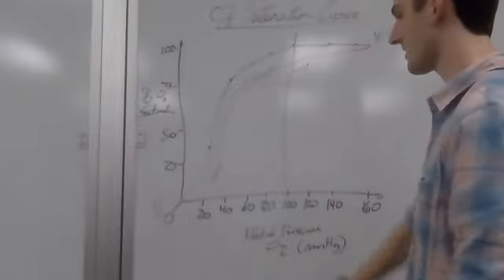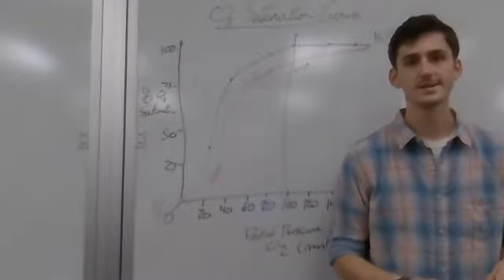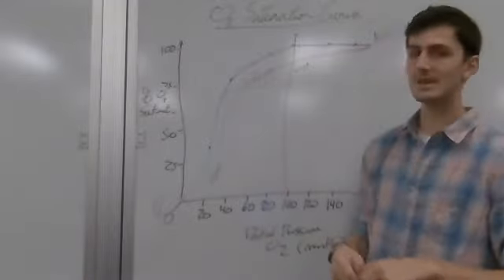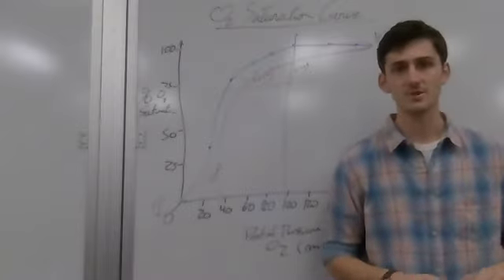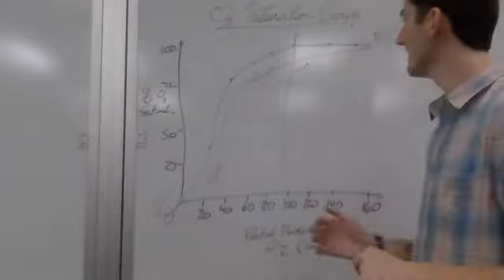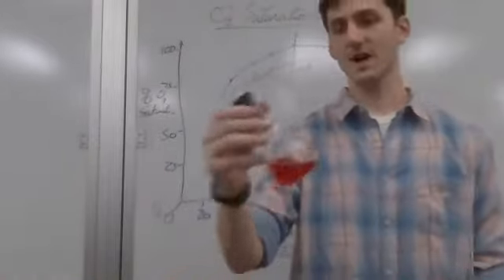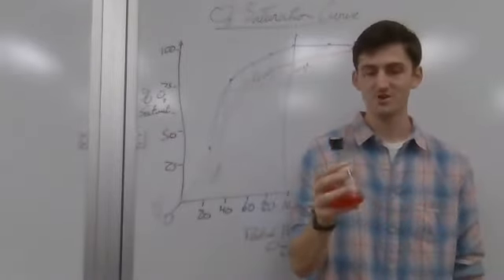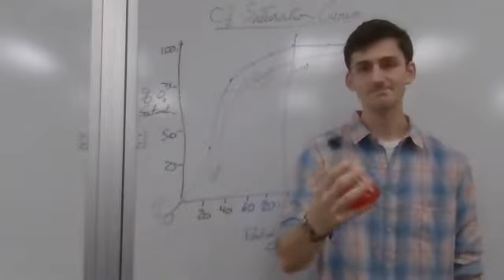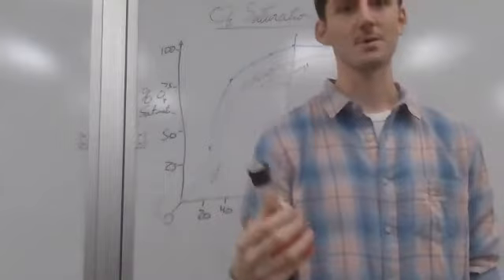So yeah, that was the point of this lab, so that you would be able to see an oxygen saturation curve. I don't know how well you can see it on this video, but I'll be sure to post a couple of examples on Blackboard. So we were using hemoglobin, which was kindly provided by Mark Clausen. He's one of the 3 people who probably make this department run. So shout out to Mark Clausen and his lab.